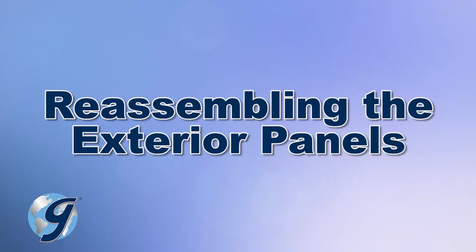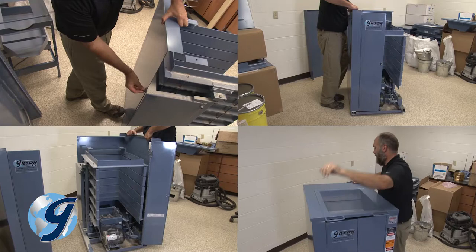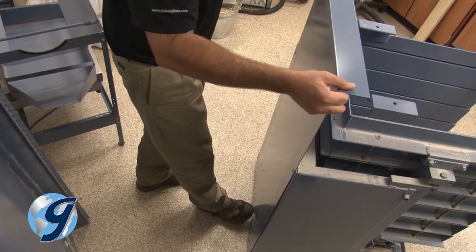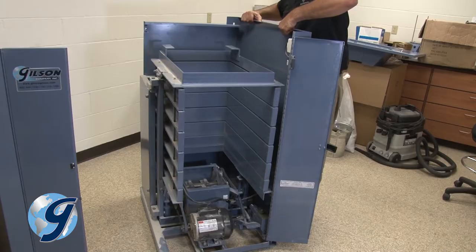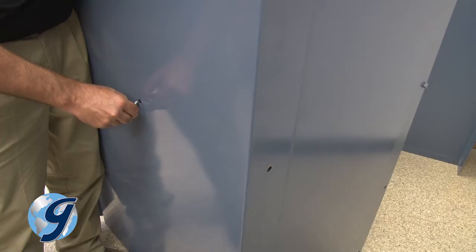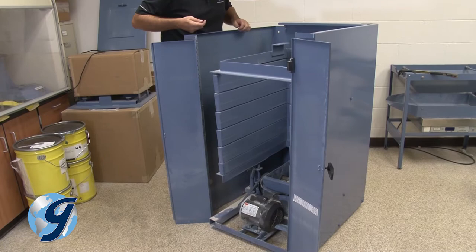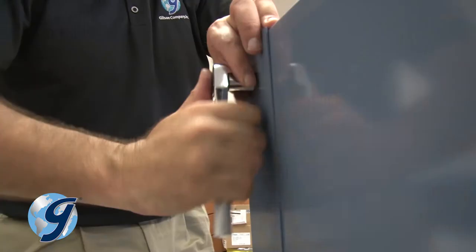Once your inspections and adjustments are completed, it's time to reassemble the unit. We will reattach the exterior panels, reconnect the timer, then level the TestMaster, and then plug in the power cord. Attach the rear panel, noting the companion screw holes from the left panel to the rear panel — do not over tighten the screws. Now attach the right panel; you may need to move the panel around to line up companion screw holes from the right panel to the rear panel. Attach the left panel, and you may need to move the panel around to line up companion screw holes. Now tighten the screws of the right, left, and rear panels.